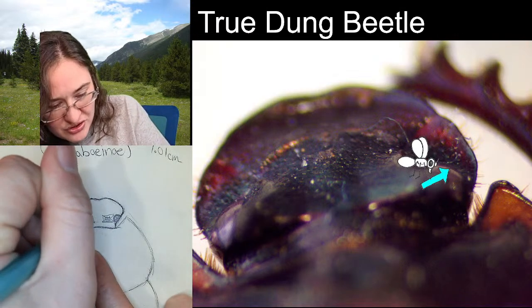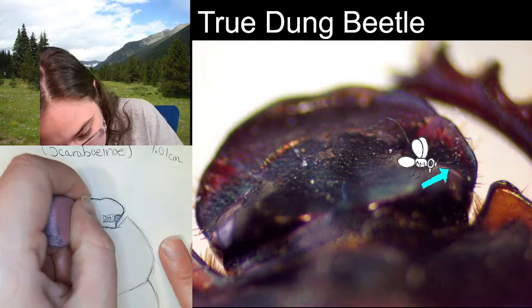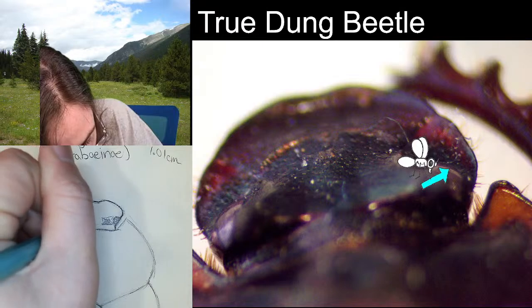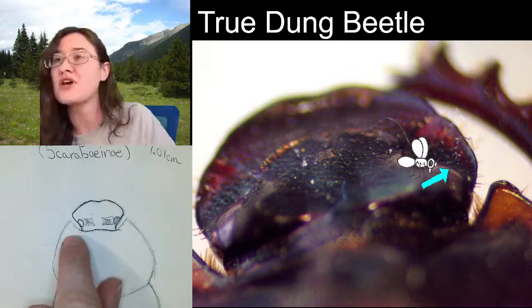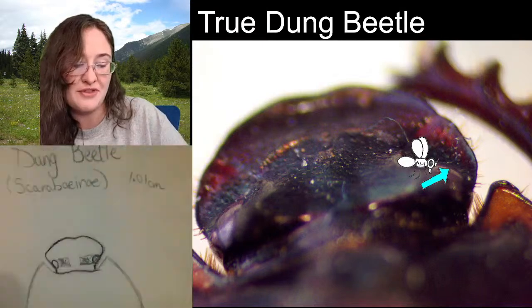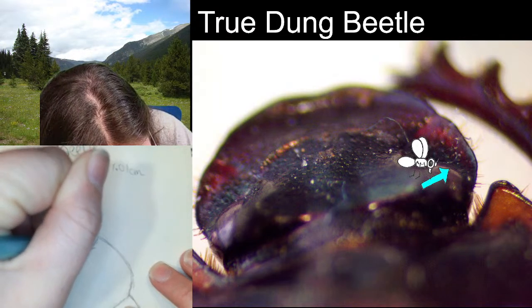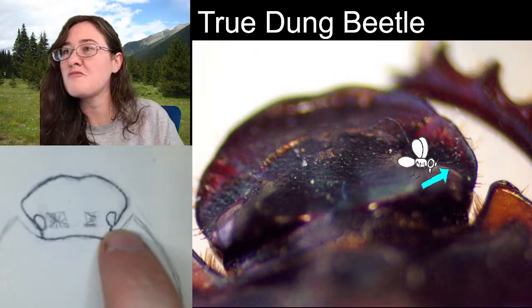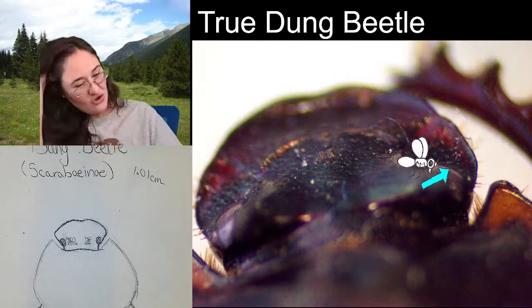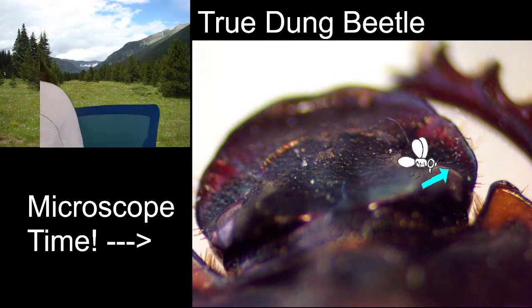Although we know that there's also that shelf that's going to block off this segment here. So let's go ahead and fix that. Because the shelf comes down towards the eye, and then you have the actual eye, and then it continues on. So something like this, where you have a point that's coming up above the eye. Let me fix my other side. So like this, where you've got a little bit of a point that comes over the eye, and this is going to be our compound eye right in here. Oh, he's so cute. That's fine. All right, let's turn our specimen so that we can see the head from a lateral point of view.